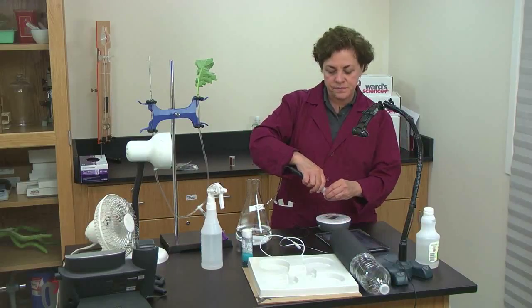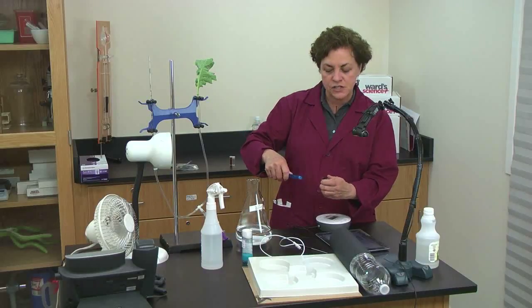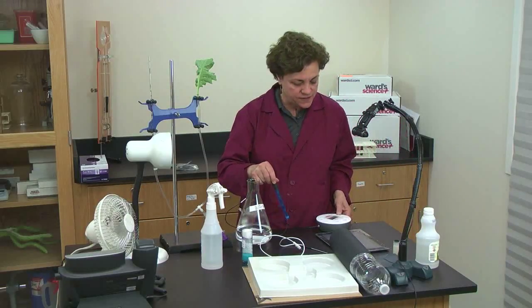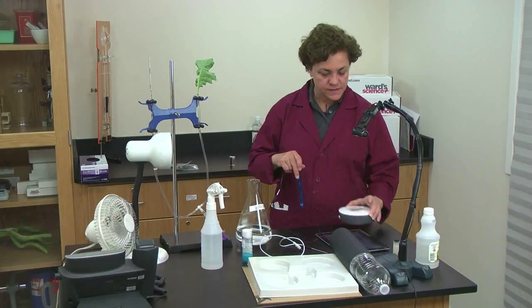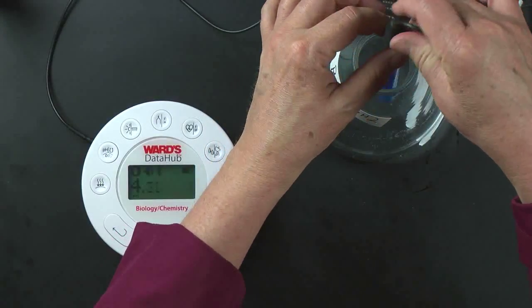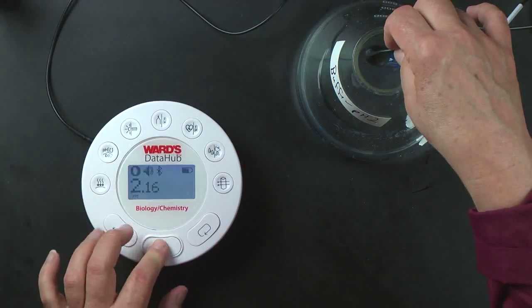Because you're doing one measurement, you can just take the pH probe and you can take that measurement directly off of this. You have to change it to pH. You can see a pH is there. Sorry, I know I'm switching back and forth. And it's going to take the pH. This is a pH buffer of 2.